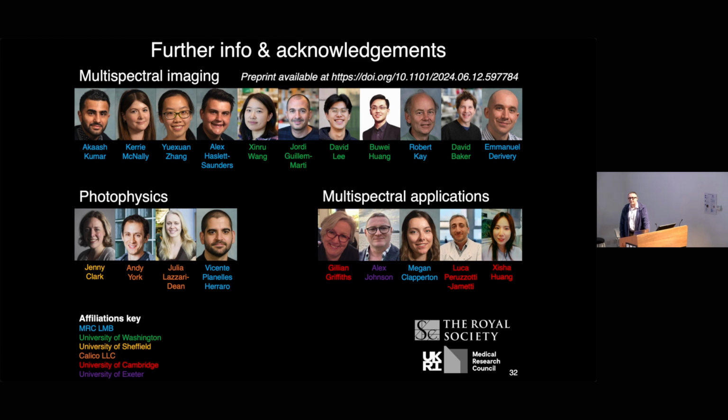So, to a first approximation, that depends on how narrow you can make the emission spectra. So with normal fluorescent proteins, probably 10, maybe 12 is the absolute limit if you're prepared to go a bit further into the infrared as well. If you're prepared to use quantum dots or some of these newer fluorescent proteins which have tighter emission spectra because their quantum yield is higher, we think you could push to maybe 16, maybe even 20 if you're prepared to go a bit into the UV with your quantum dots. But somewhere in the order of 10 to 20 is probably feasible.